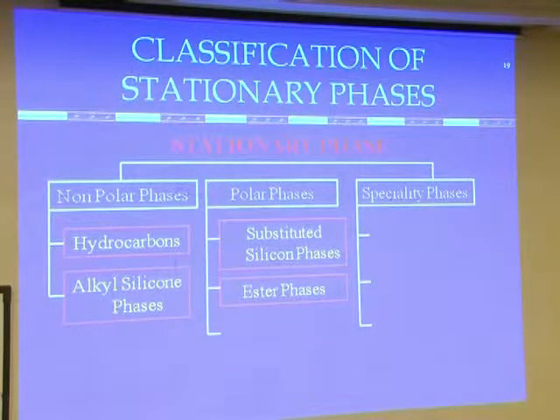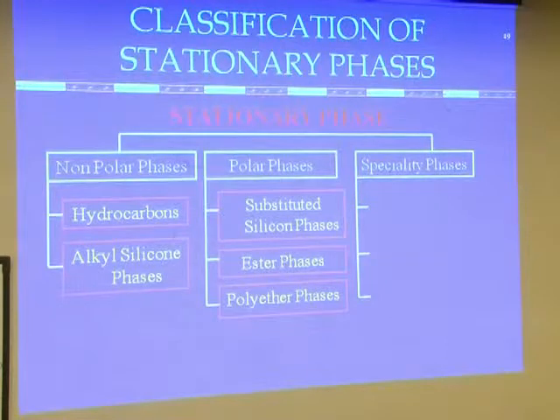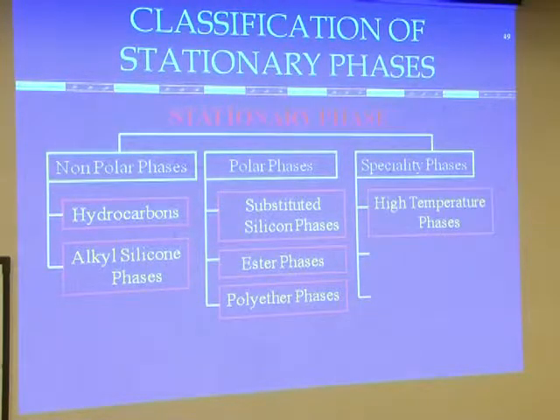Then ester phases are polar. Next, polyether phases are also polar in nature. Speciality are high temperature phases.